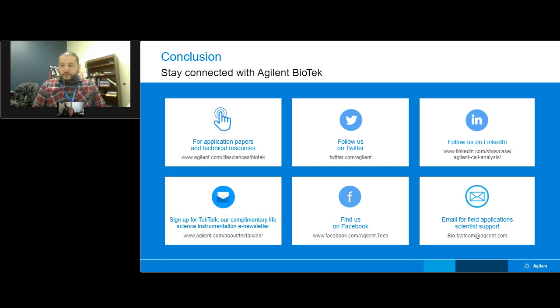It's very versatile across magnifications too. So if you're going to be imaging things all the way from adherent cells up to larger, thicker samples, perhaps the deep sectioning just may be more versatile for you. If you have a very focused sample type that you need to develop, but you want to eliminate as much out of focus light as possible with a confocal system, perhaps consider the 40 micron disc.